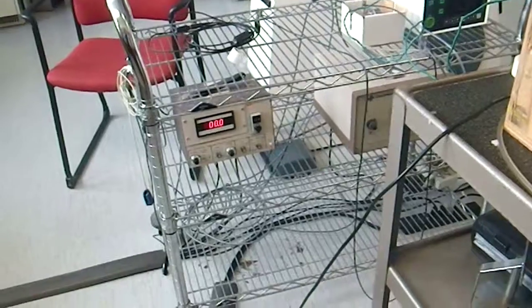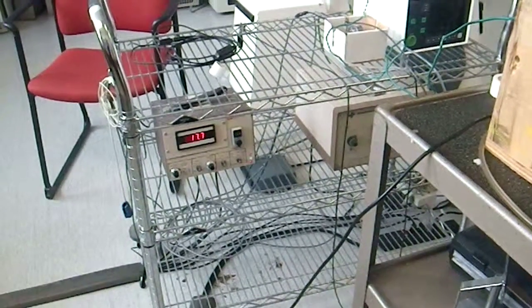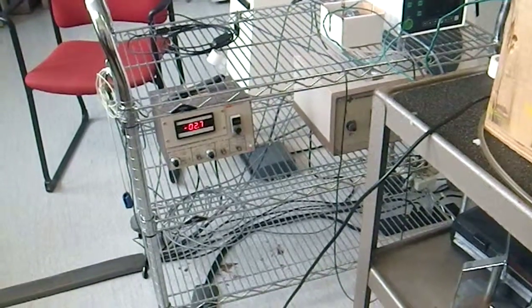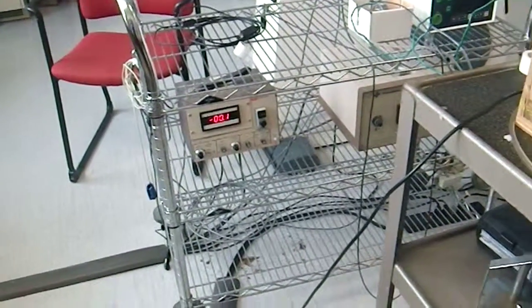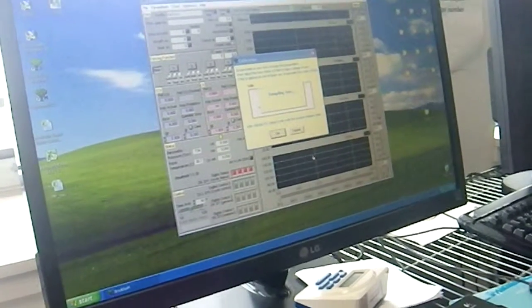So the first thing I do is I take this plunger and I look to see how the flow is, make sure it's roughly the same in both directions, and afterwards I look at the screen and make sure that it's also measuring flow. Looks good, and the computer's good. So it's taking in some data. So you hit OK. Yeah, just wait for this to do its thing.